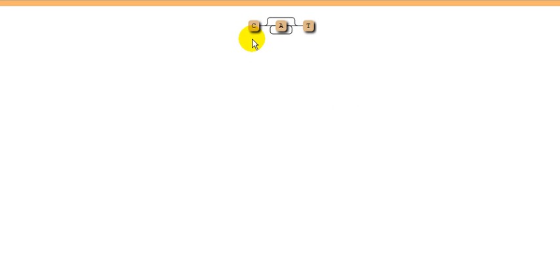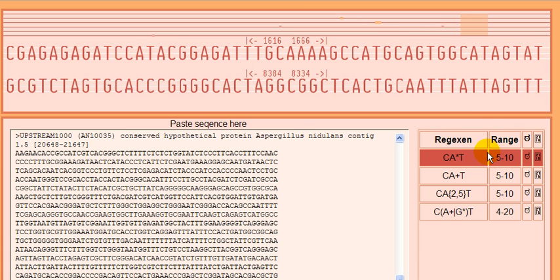So now we see that this is such that the match can be successful if there is a T right after C, or as many numbers of A in between. So it is either that or this. That is for the star quantifier. Now if you define with the plus quantifier, that means there must be at least one or more.